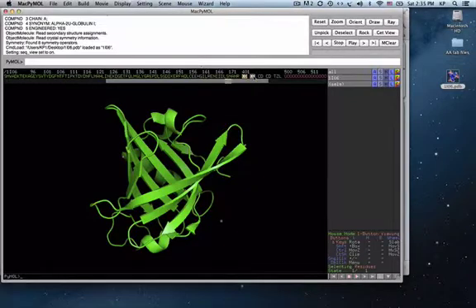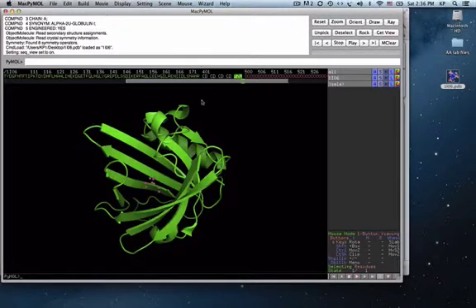These CDs are cadmium ions, and these result as part of the crystallization process. This TZL is the ligand. And you can know this if you're viewing in the one-letter codes, which I highly recommend. You'll see little breaks for things that are not actually physically bound together in a covalent bond. So this is our ligand. We'll get back to that in a moment.